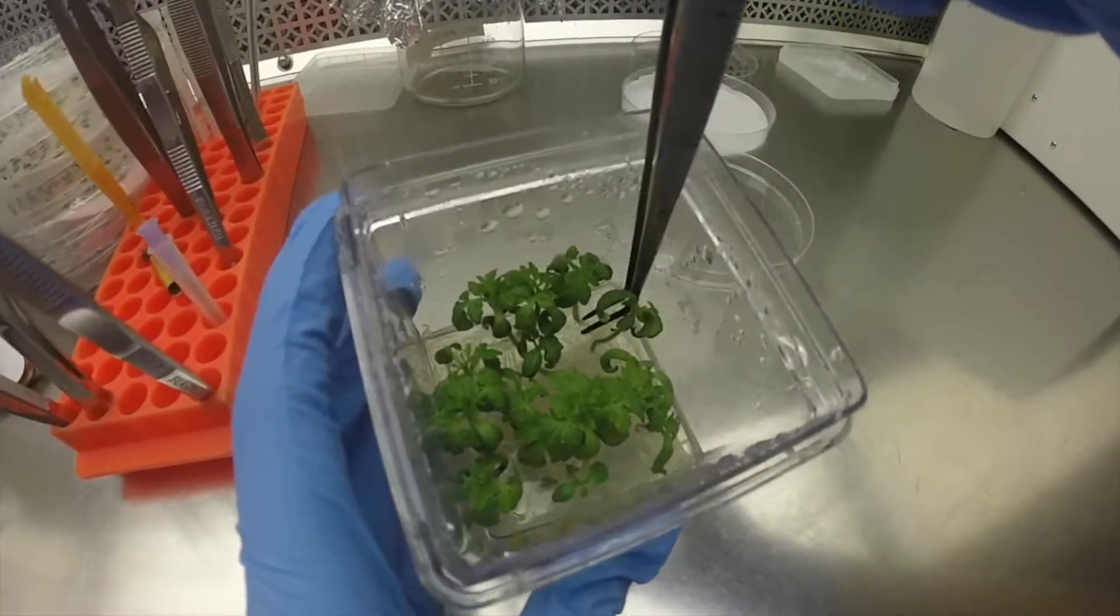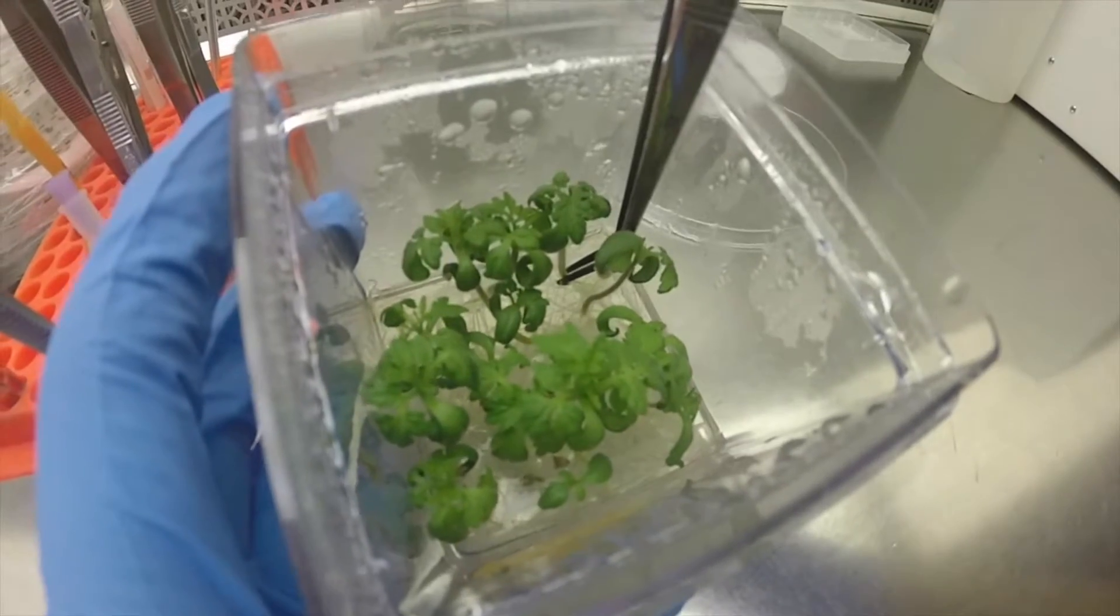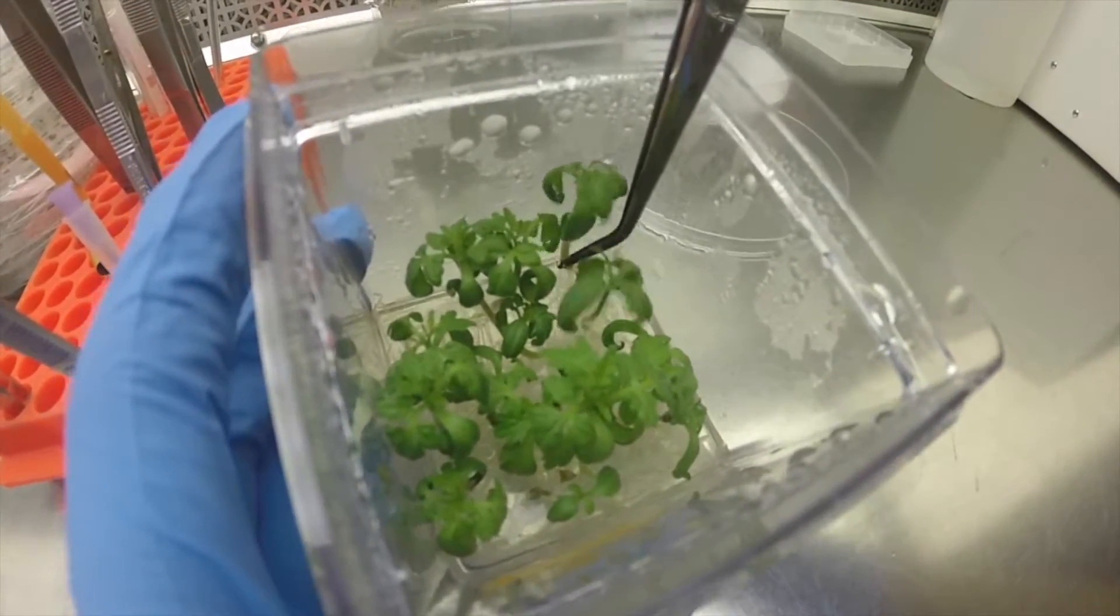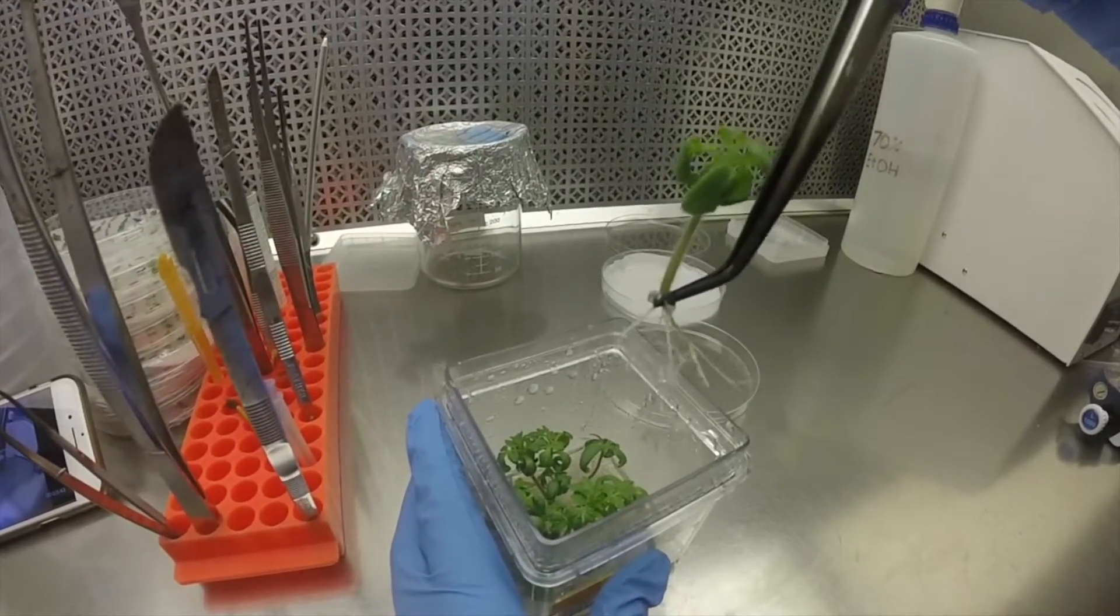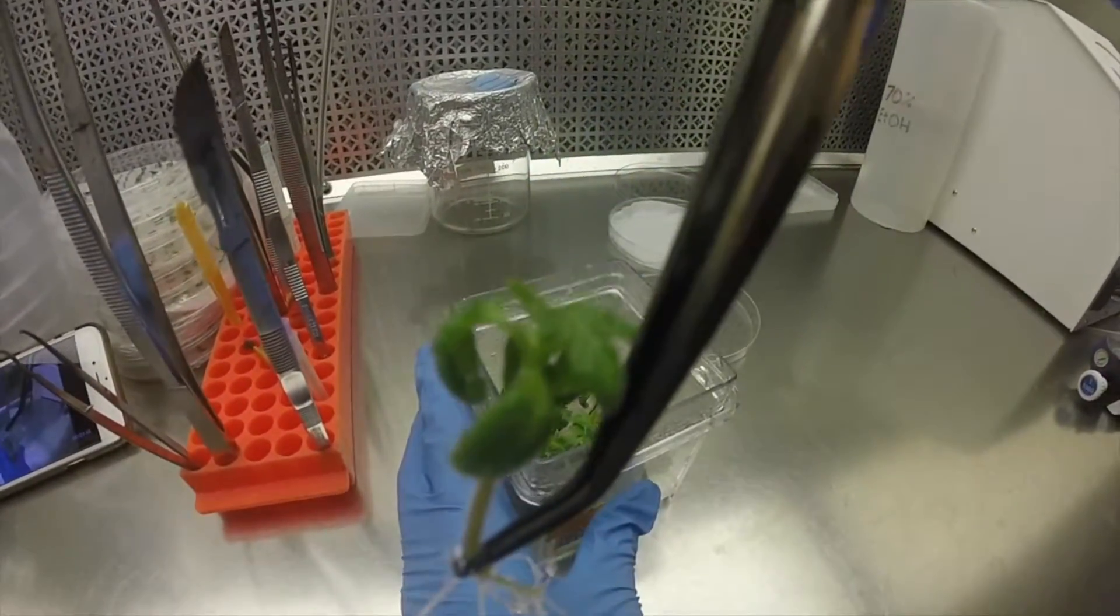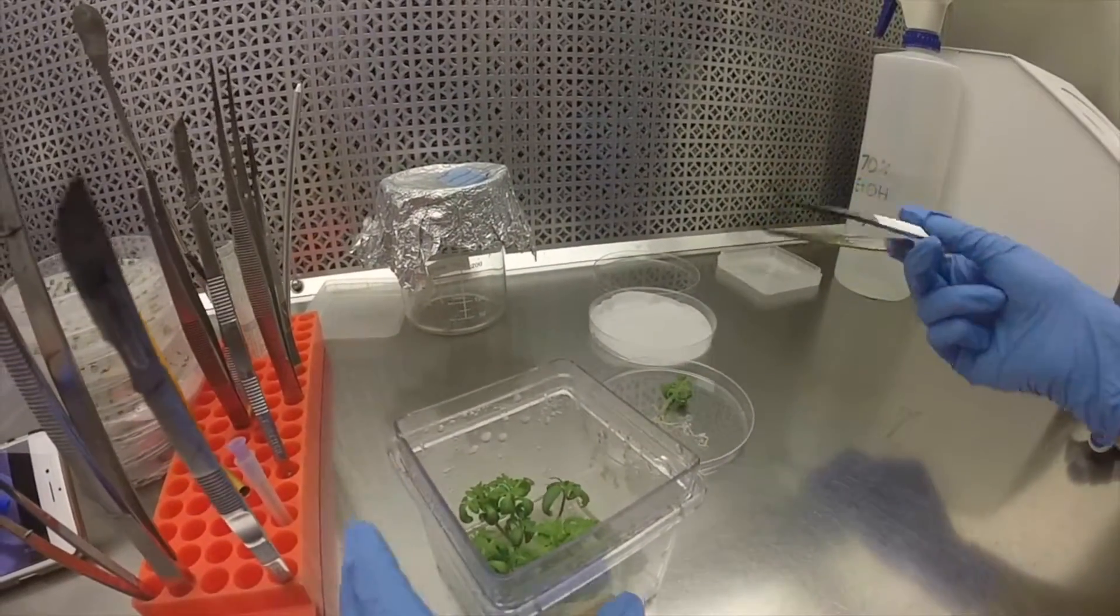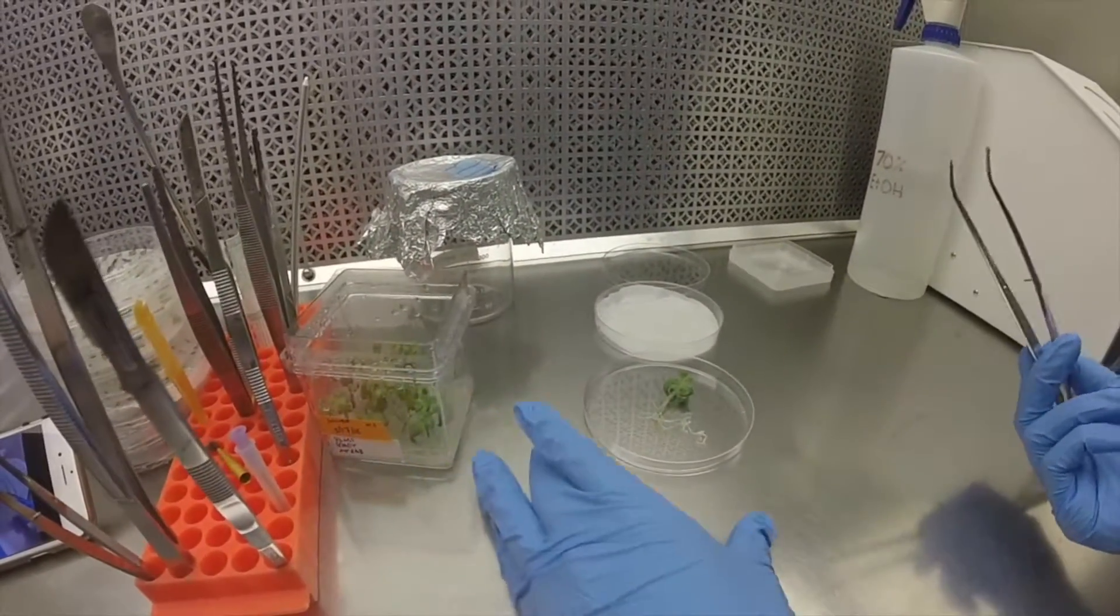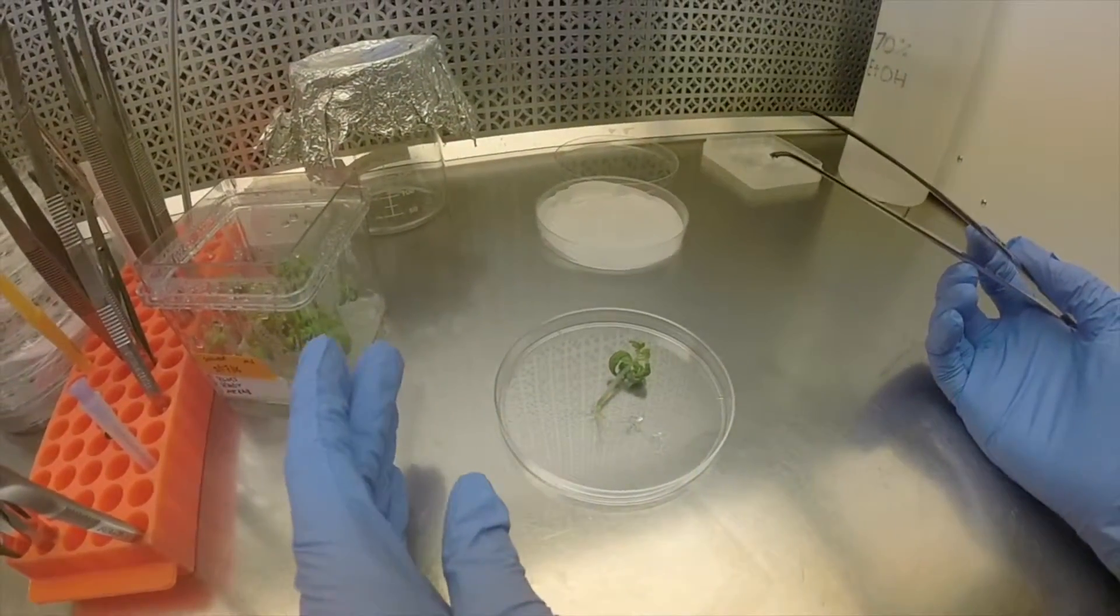We're going to start by grabbing the plant at the base of the stem, right where it meets the media, and we're going to squeeze and pull it out. Usually you'll get a few roots with your little plant. We're going to place it on our sterile petri dish. This is a different sterile lid that we'll be using to cut on.